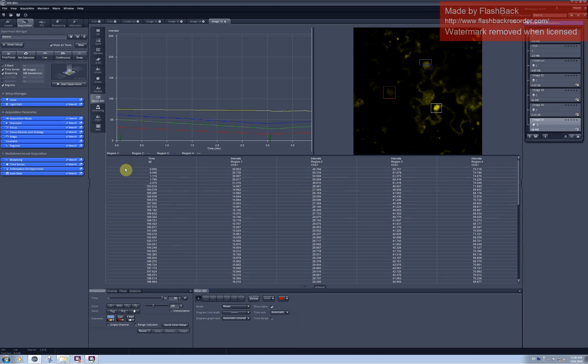You can export this data into Excel by right-clicking on the table and click on copy table.